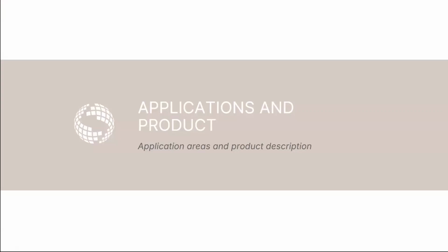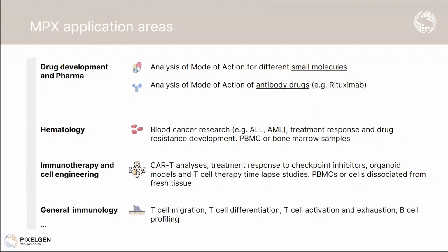I want to end with talking a little bit about applications, just an overview, as well as the product. Here I have some examples of what people have used molecular pixelation for. It's always good to hear a little bit about what people use.